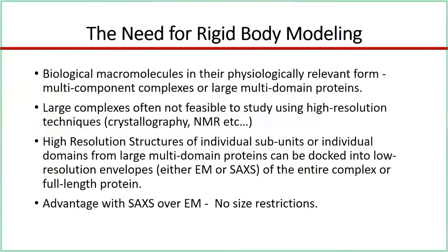In their function, there is usually a very high degree of interaction with other biological macromolecules, and a lot of these involve formation of functional complexes. So the focus, justifiably, in the community has shifted more towards the study of macromolecular complexes.